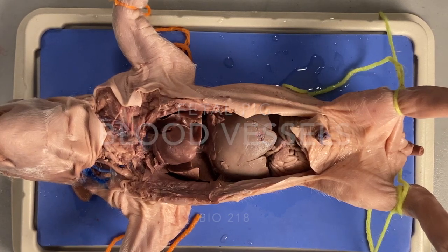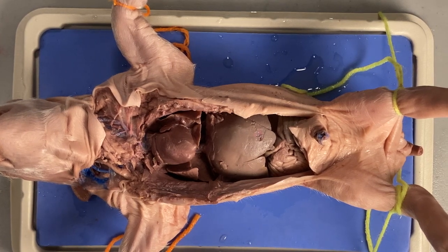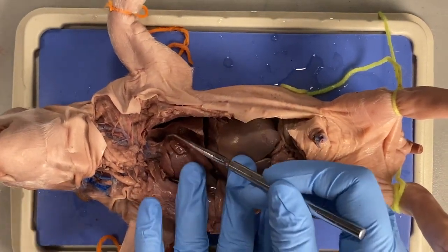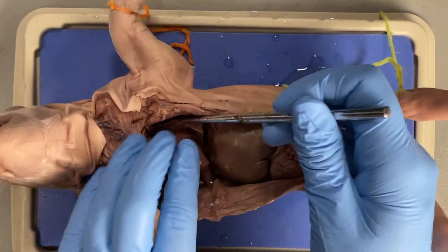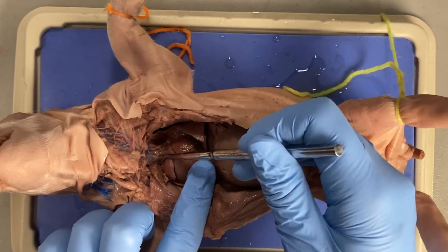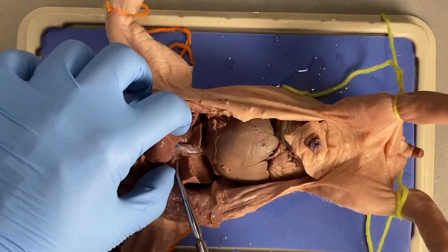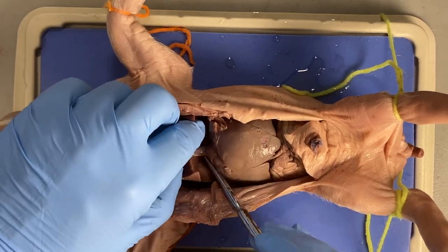The next thing we need to do with this pig is to find some of the blood vessels. Most of the blood vessels attached to the heart you can probably already find. We found the pulmonary trunk, which is right between the auricles, and behind that you have the aorta, and behind that the superior vena cava. Below the heart we can see the inferior vena cava pretty easily, as long as you've removed the majority of the pericardium.